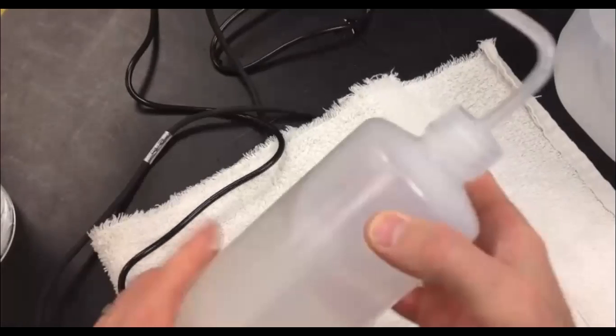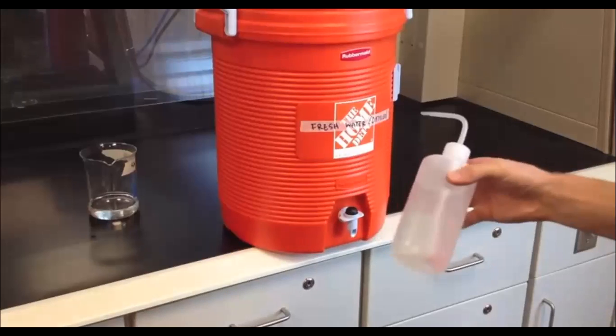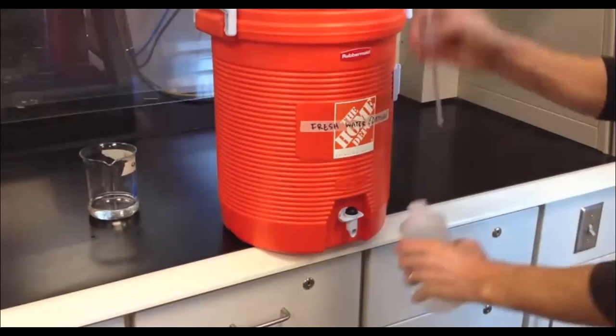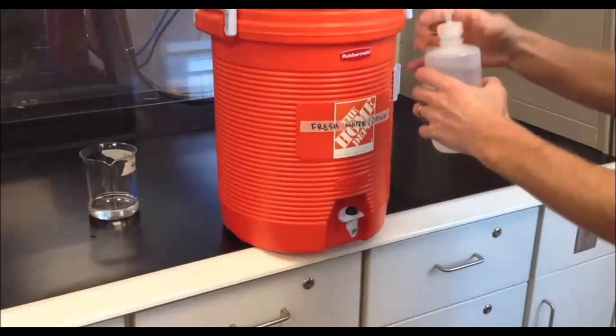Only ever use distilled water. If the distilled water ever runs out, make sure to only fill it up using the distilled water in this container and not to fill it up from the sink, so that these always only contain distilled water, purified water.